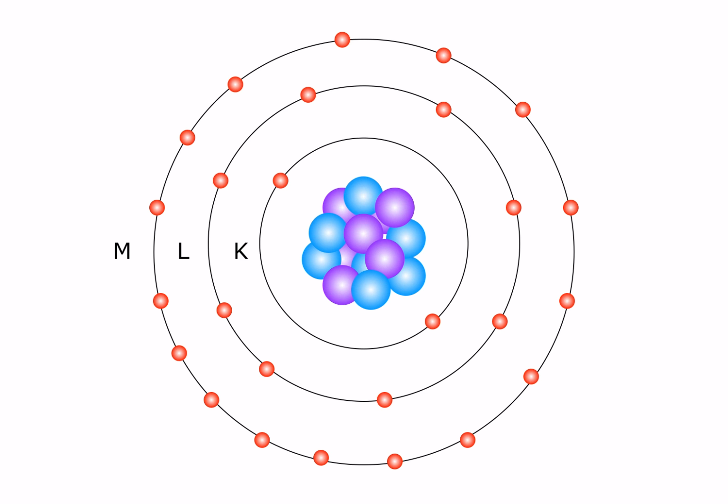You can think of it this way. Imagine the nucleus is the center of your city. The K shell are the houses around the center. The L shell are the suburbs. And the M shell are the boonies. Everyone wants to get to the center because it means a shorter commute to work. But unfortunately, there's only so much space there. And to make it even more interesting, each house has about the same price. So if an opening comes up in that K shell, boy, you had better get on that.